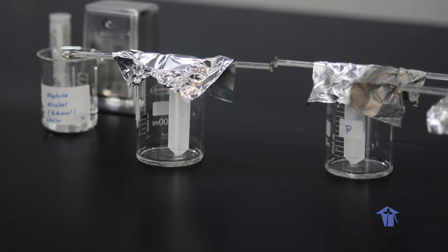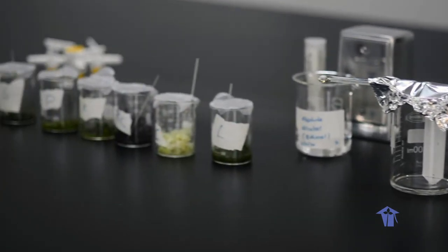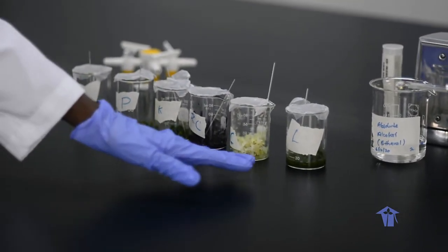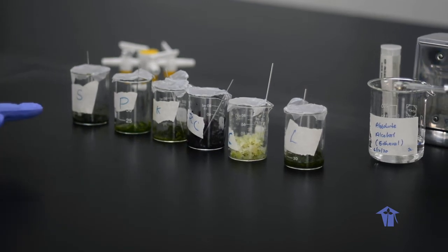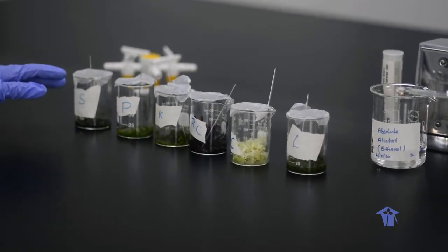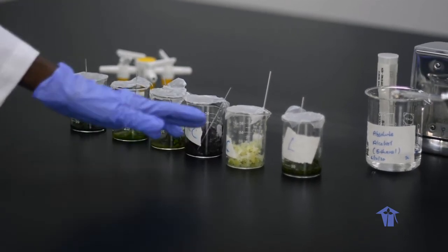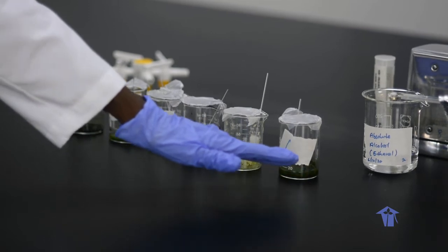We have come back to our chromatography experiment. Recall that we had used six different sources of plant pigments obtained from pak choy leaves, spinach leaves, kale, red cabbage, cabbage, and lettuce leaves.